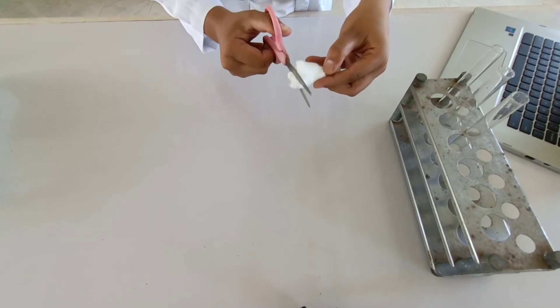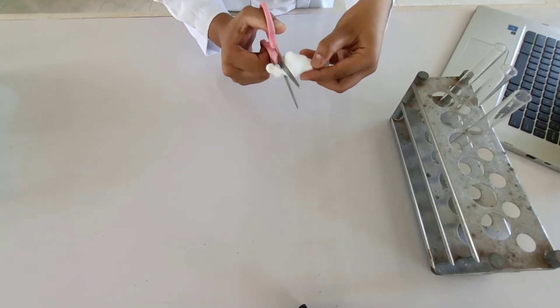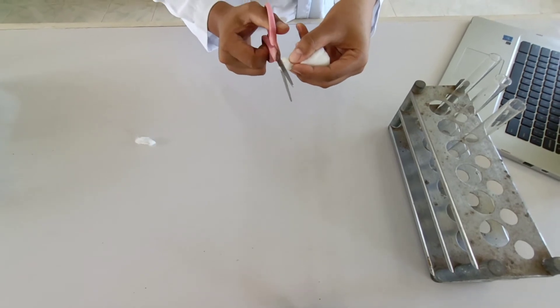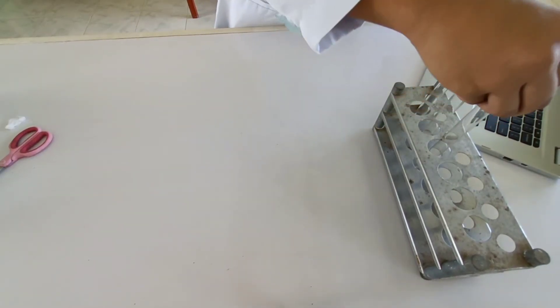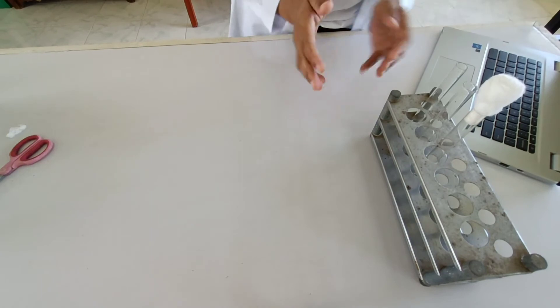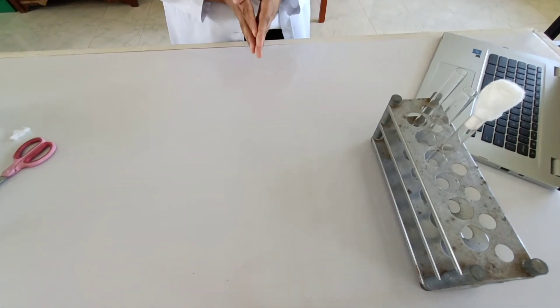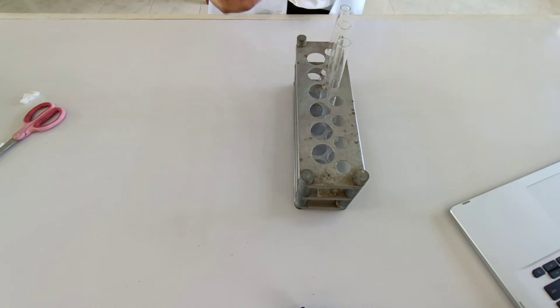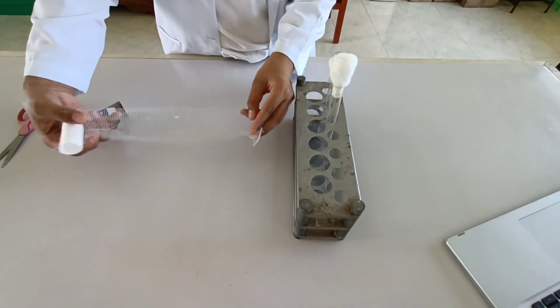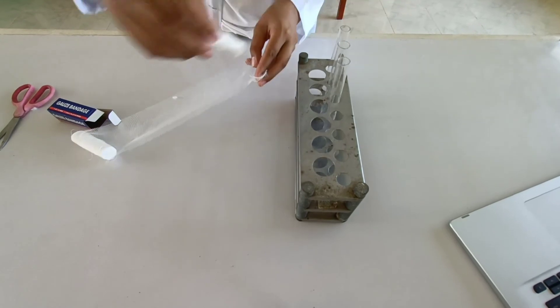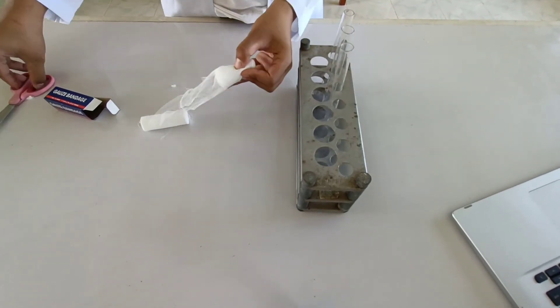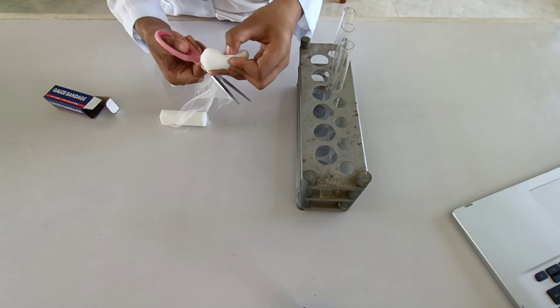Cut the extras on both sides. And this is how it looks like. To prolong its good shape, wrap it in gauze bandage. Then cut it.